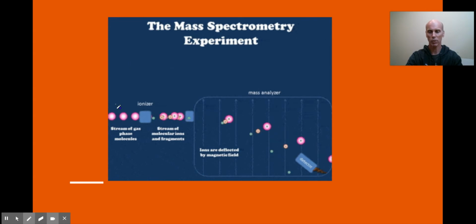So at its core, mass spectrometry is this technique through which we take molecules. So we're not limited to electrons now, like Thomson's experiment might have been. We can use pretty much any molecule. We have to ionize it. So there's an ionizer. Once it's ionized, then we can play around with accelerating the charges. You can see that taking place in this section here. So we have an acceleration section. And then we can do all kinds of tricks with putting these charged particles through electric or magnetic fields. And that's really where the physics lies.